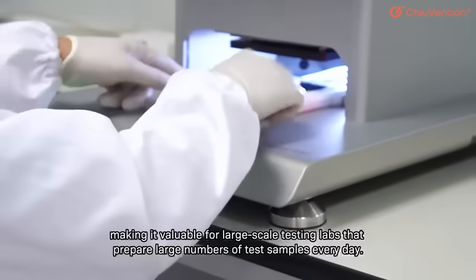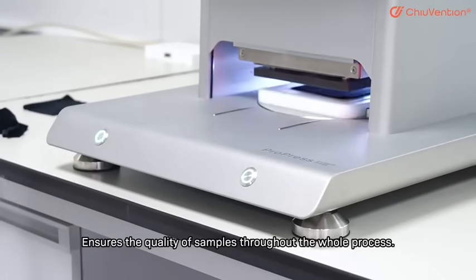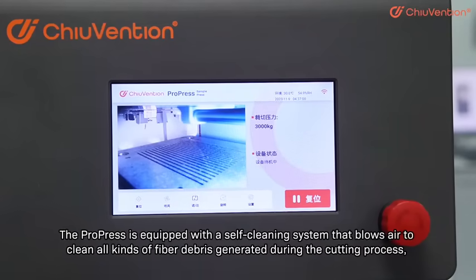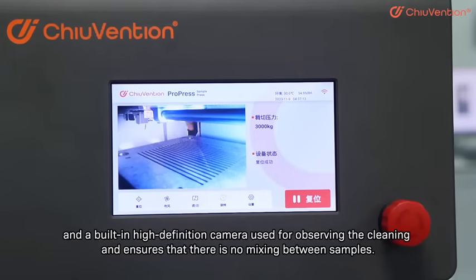Making it valuable for large-scale testing labs that prepare large numbers of test samples every day, ensuring the quality of samples throughout the whole process. The ProPress is equipped with a self-cleaning system that blows air to clean all kinds of fiber debris generated during the cutting process, and a built-in high-definition camera for observing the cleaning and ensuring that there is no mixing between samples.